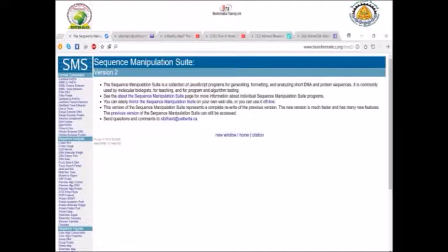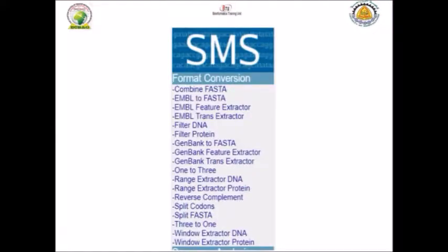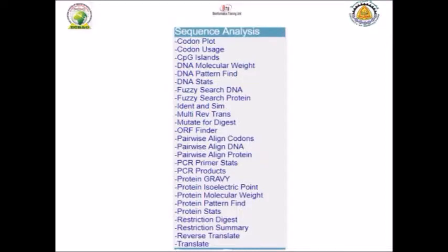The first section is called Format Conversion, which contains many tools like Combine FASTA, Build FASTA, and Feature Extract. We have described some of these tools and will describe the rest later in upcoming episodes. This is the first section called Format Conversion.